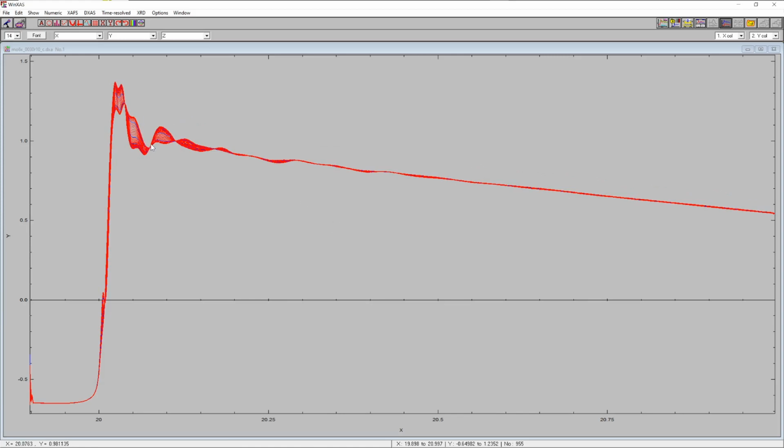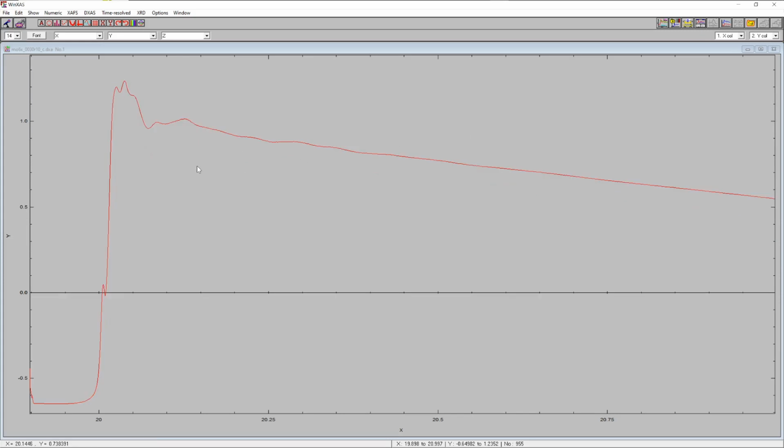You see there are typical isosbestic points here. And so this is a series of spectra. Apparently there's some chemical reaction going on there, and we're going to analyze this set of spectra now using the macro capability and the automatic macro analysis feature here.